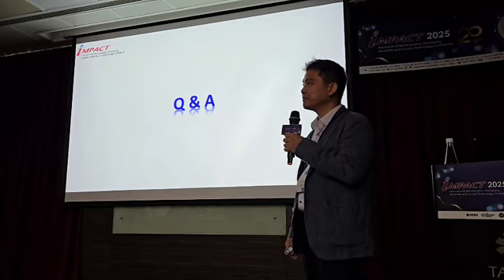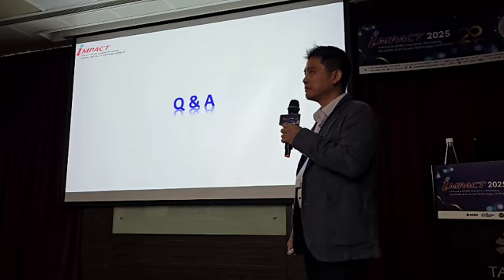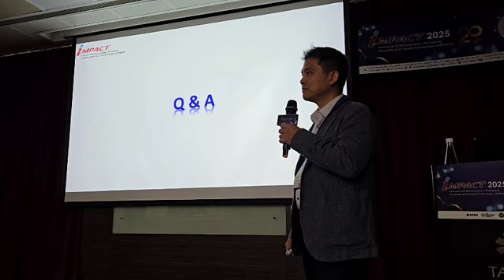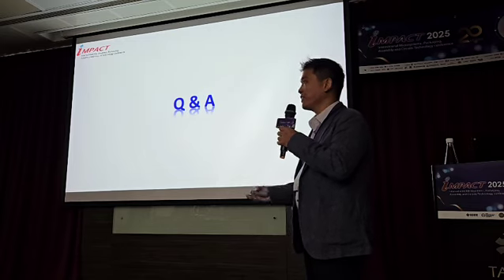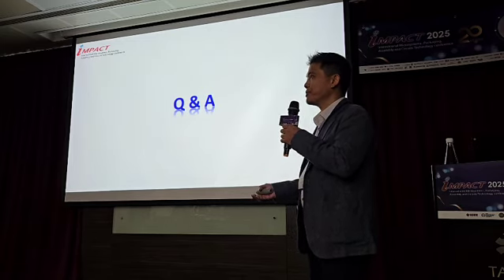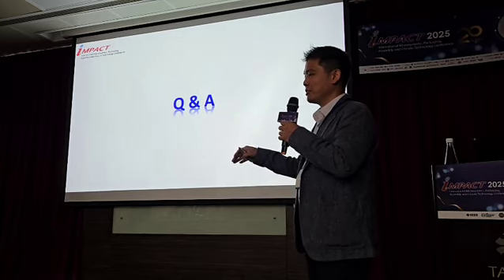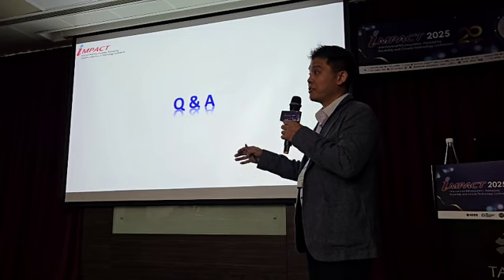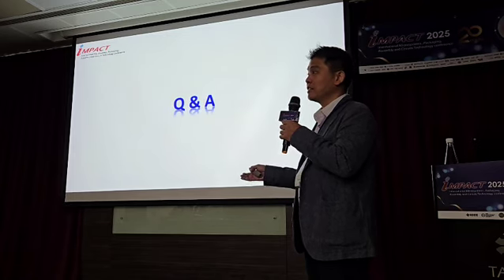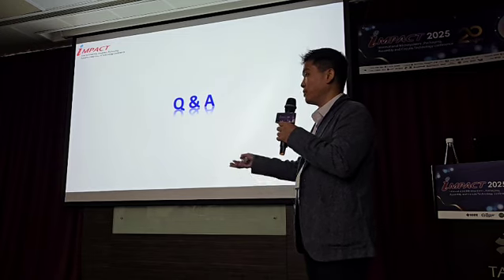In terms of spatial resolution, is it possible to make a measurement of a micro crack resulting from some contamination? Well, if the crack is air, then of course there's no IR signature we can generate from the opening. But if there is actually material hanging on the side wall that led to the formation of the crack, or let's say there's a difference in these TGVs, right?